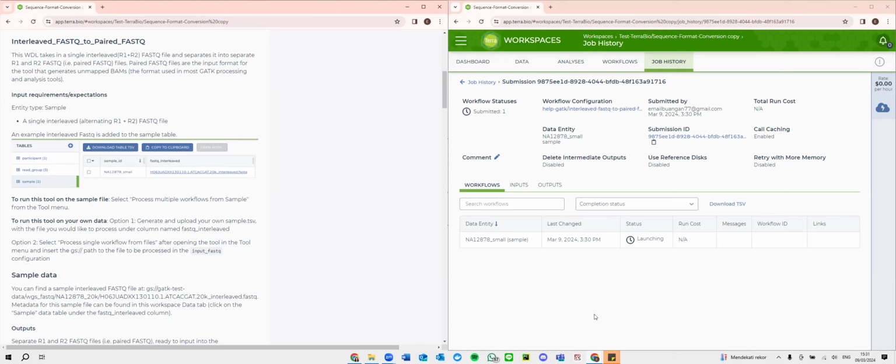And if you can see in the actual page, we can't really find the tool menu. So we assume that the platform has been updated, but the tutorial hasn't been updated according to the features in the current platform. So maybe that's just one thing we'll add.